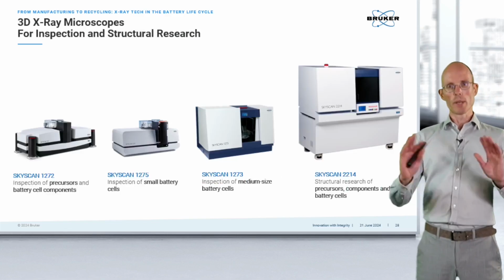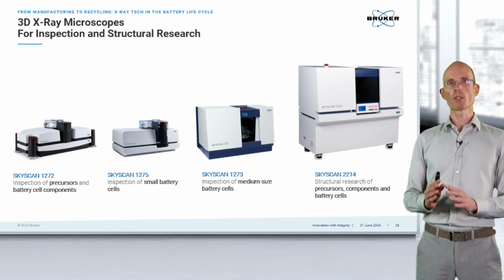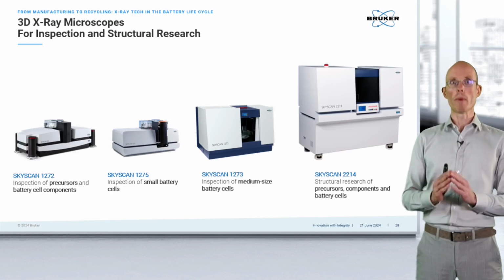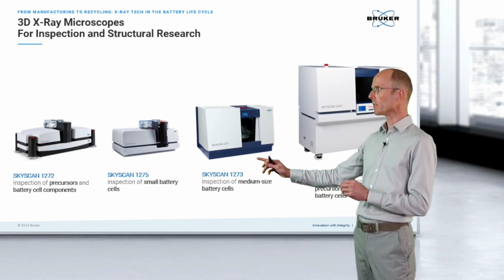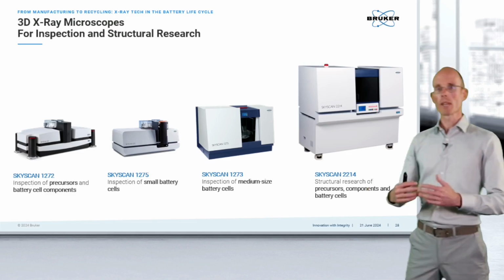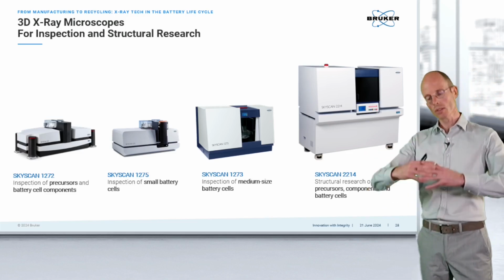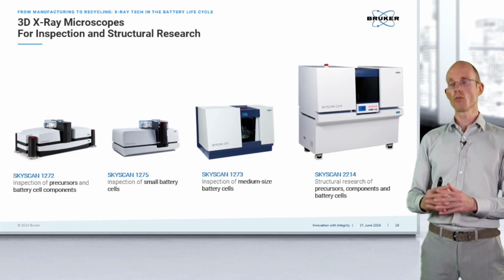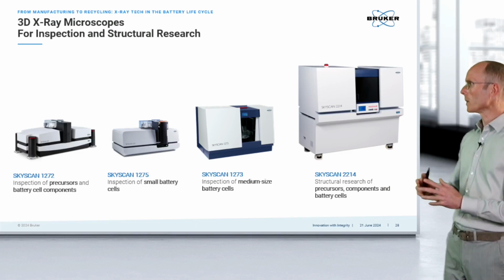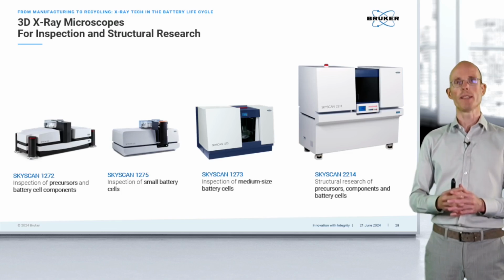Medical CTs are very big systems and have a moderate resolution of something like 0.5 millimeter at best. With X-ray microscopes, we get down to micron resolution, and that's already possible with benchtop systems. And we can even go one step further with special designs and dedicated X-ray components completely decoupled from external vibrations. With systems like SkyScan 2214, we can even achieve sub-micron resolution down to 400, 500 nanometers.